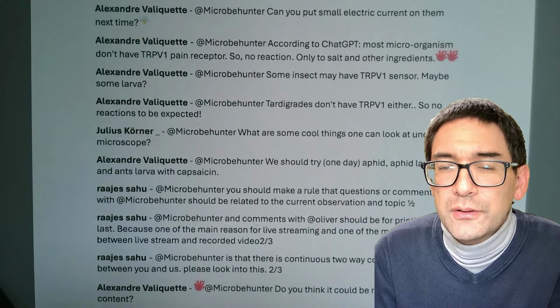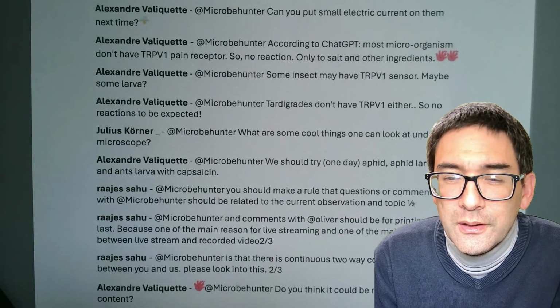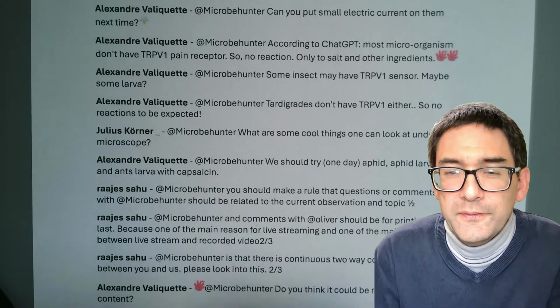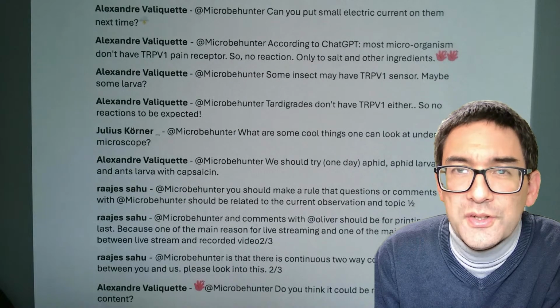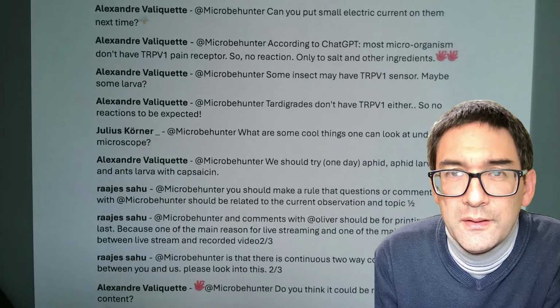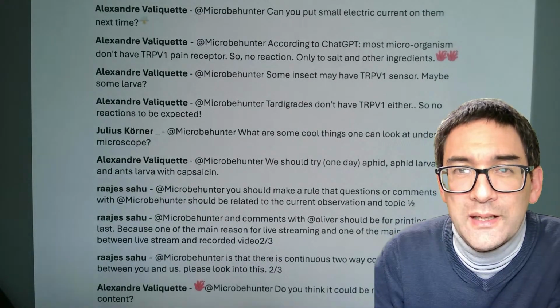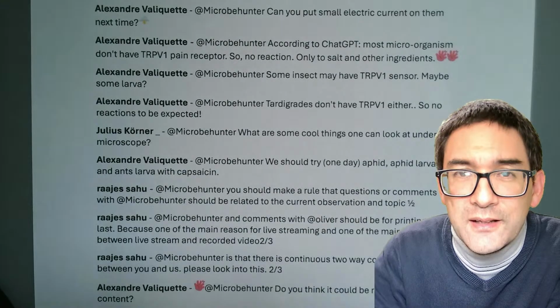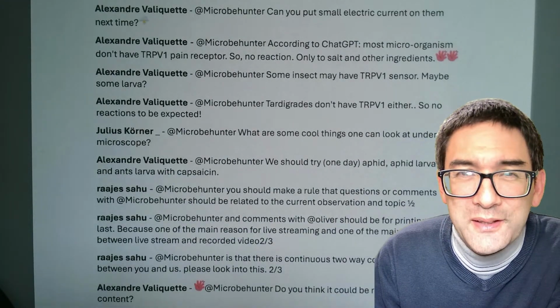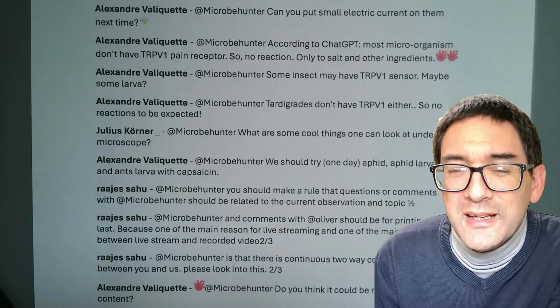Side illumination, from Alexander. You mean oblique illumination? Oh, that is okay. This is something that I actually do know, if this is a thing. Because oblique, if this is the same what we mean, this is basically when the light of the microscope strikes the specimen from one angle, and therefore you get a slight 3D effect. It's a little bit similar to DIC microscopy, not quite the same, but very similar. Yeah? And easy to realize, but you have to be patient again, adjusting everything.